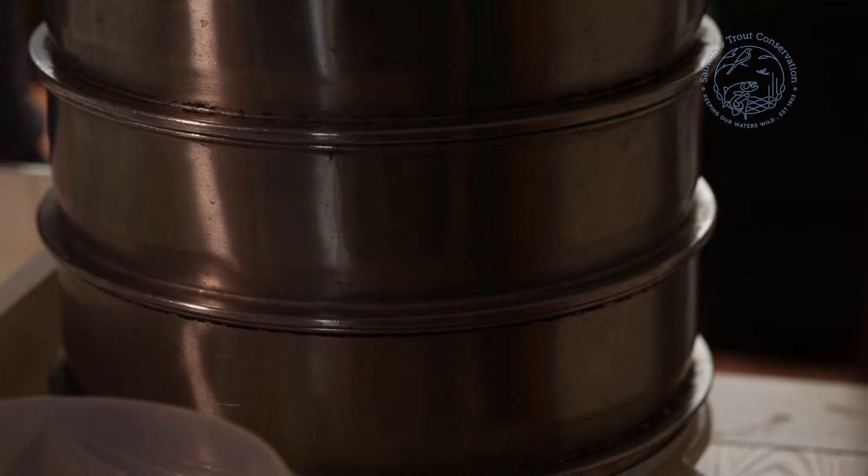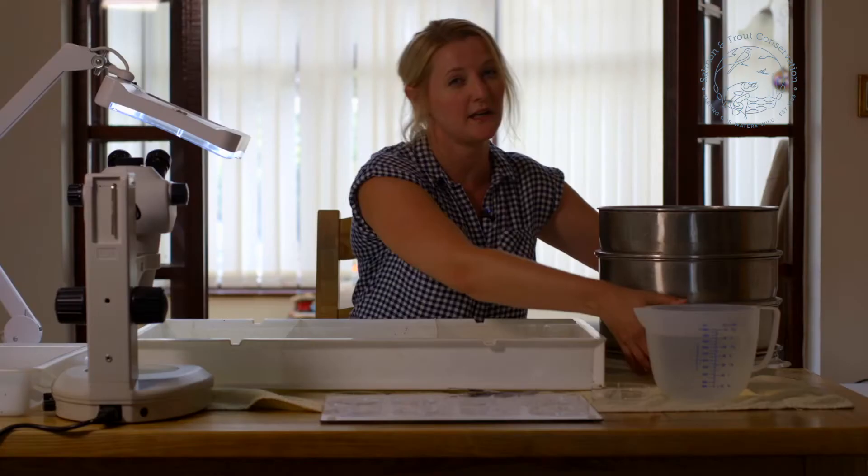This fine sieve is to make sure that we don't lose any of the animals through it, and this is the most important. We also have a tray underneath which will help us when we're transporting the sieves to make sure that we don't lose any of the animals out of the bottom.